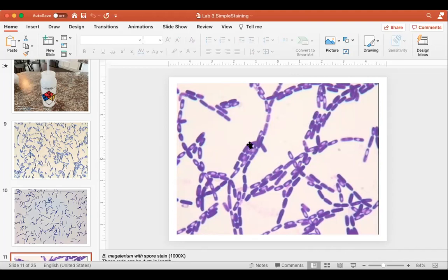Now, you might ask, well, why are these cells stressed out? Because cells only sporulate when they're feeling stressed. This is an old culture. That's a stressful thing to a cell. In other words, these cells were placed into some broth in the laboratory, and then the broth was put in the incubator, and the cells were allowed to grow, to divide.